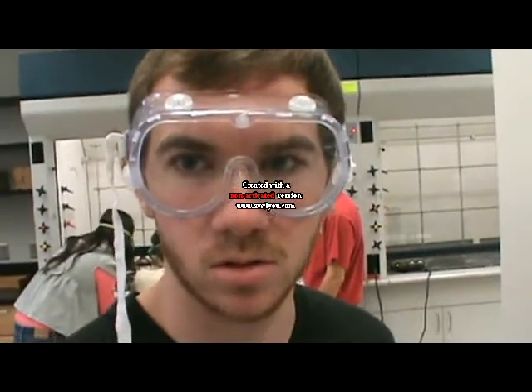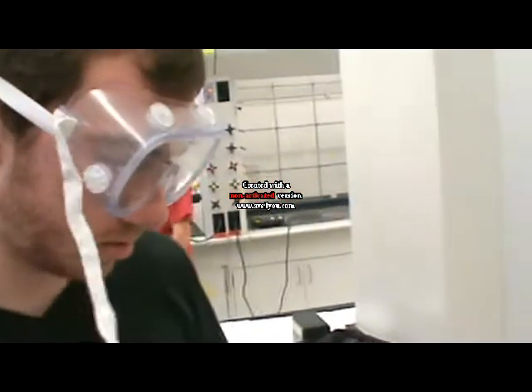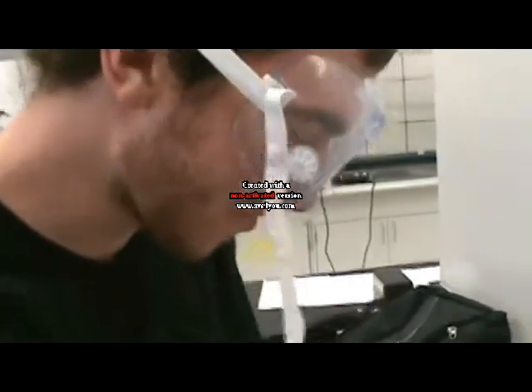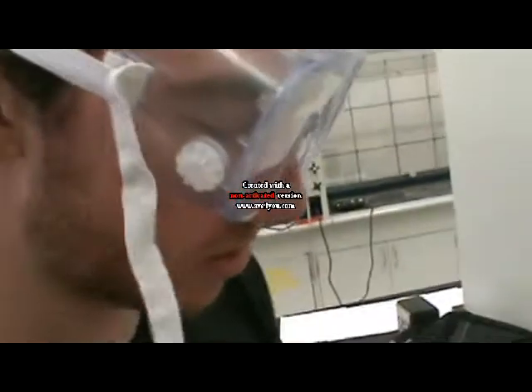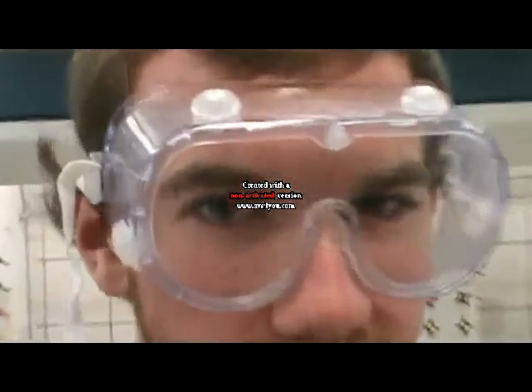What? Action. I don't know what I'm doing. You set all these up. Define chromatography. Chromatography is the process of separating a substance and identifying its components.